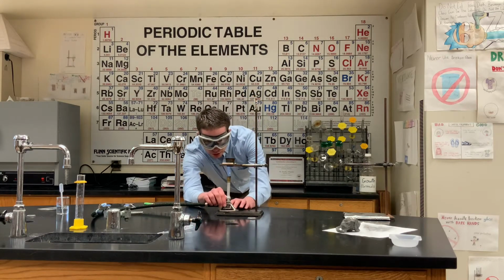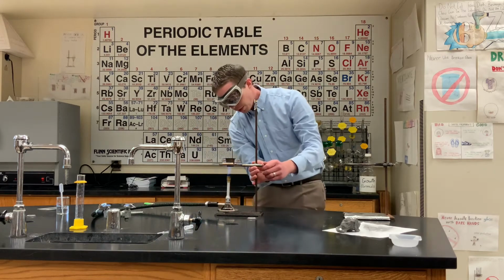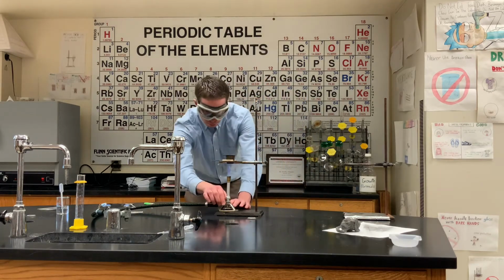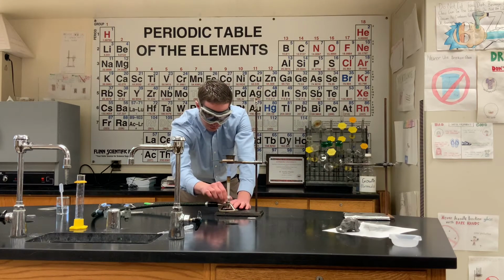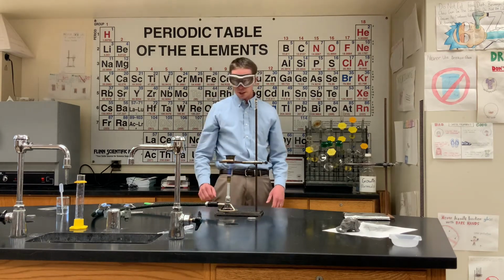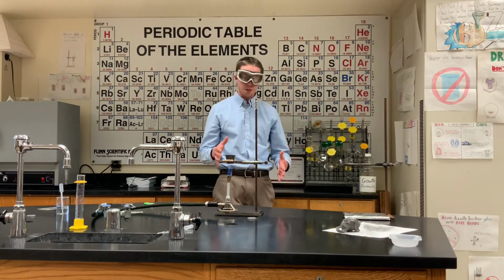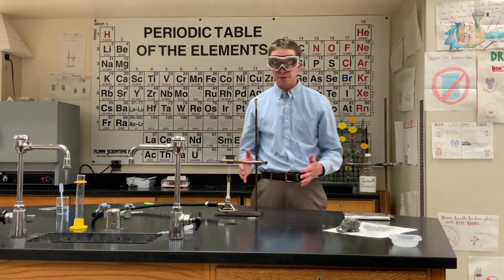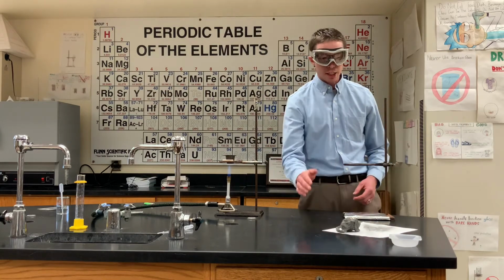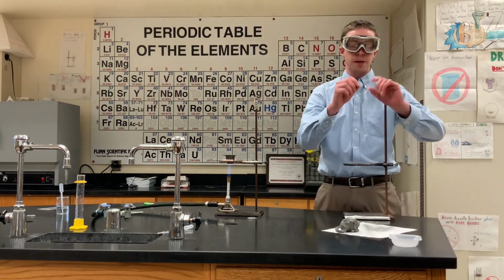So right now it's actually a little bit too close to the crucible. I'm going to adjust the flame a little bit. I'm going to bring this up so it's in the hottest part of the flame. And there we go. We're going to heat this for 5 minutes, burn off the impurities on the crucible and the lid. And while that's happening, I am going to prepare my magnesium.